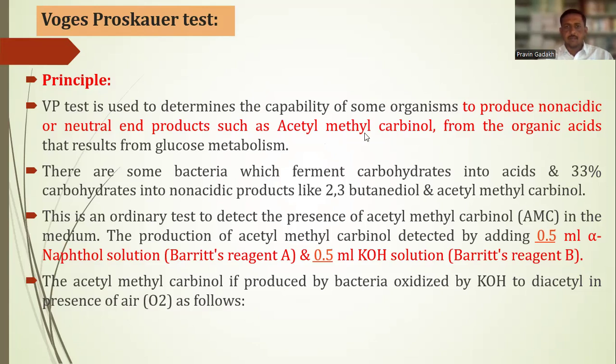For the MR test, we normally use MR-VP broth, and for the VP test, we also use MR-VP broth. In this test, we have to determine the ability of the particular organism present in the water sample to produce non-acidic or neutral end products, like acetyl methyl carbinol, after incubation.